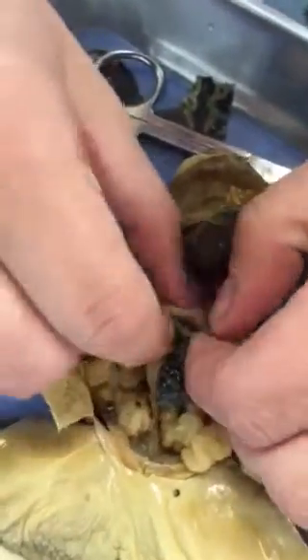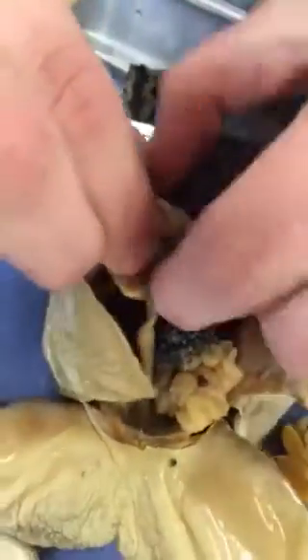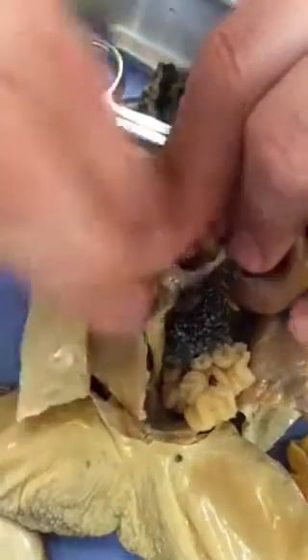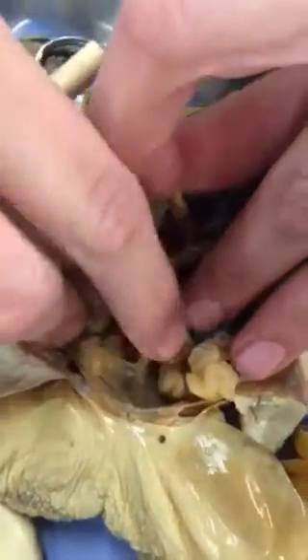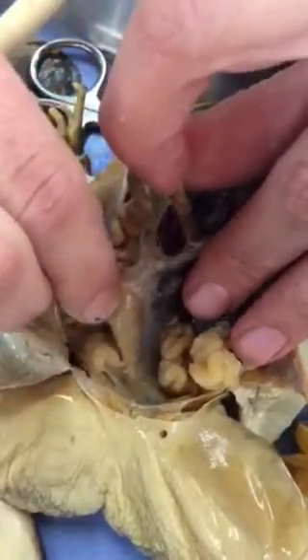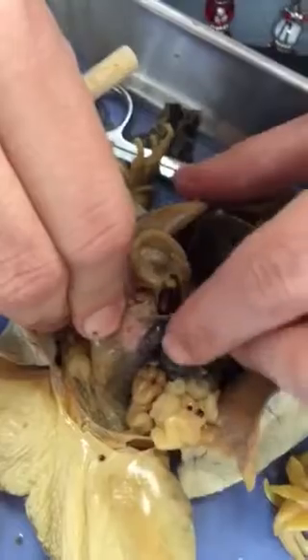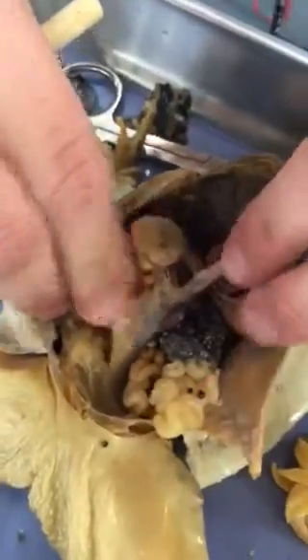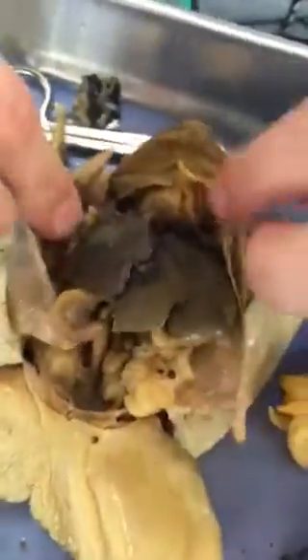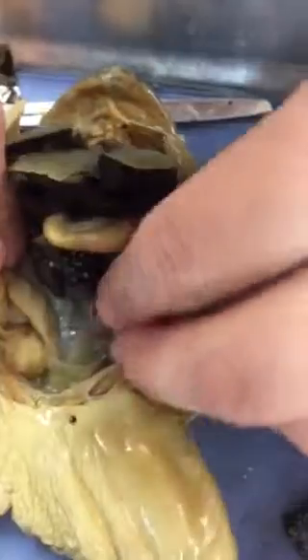I will probably disarticulate the small intestines to where I basically take out the membrane. And so you might see the small intestines being pulled apart. The diameter of the small intestines, thicker down here, is going to be the large intestines. And then you see in the mesentery of the small intestines right here, this bean structure, the bean is the spleen.